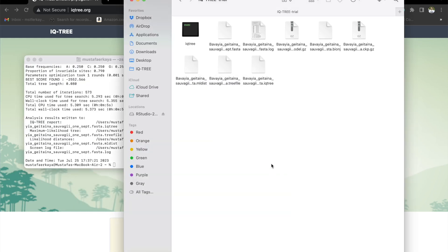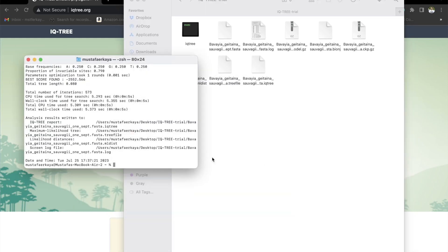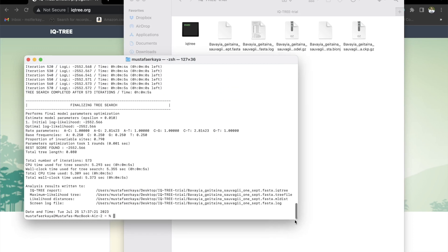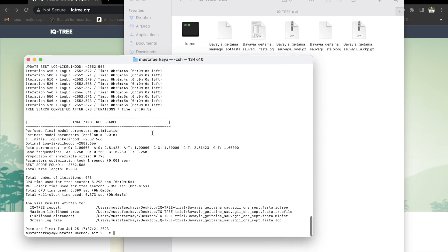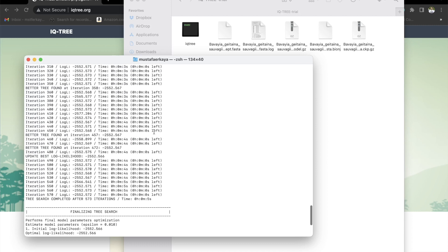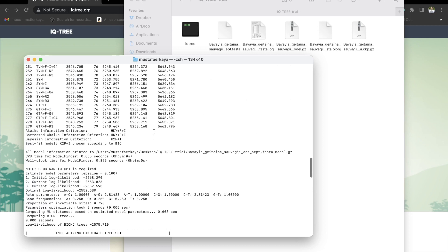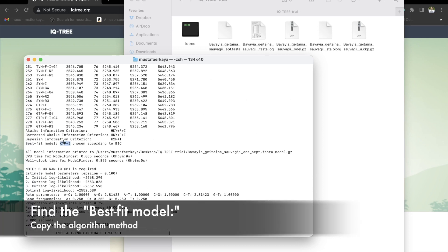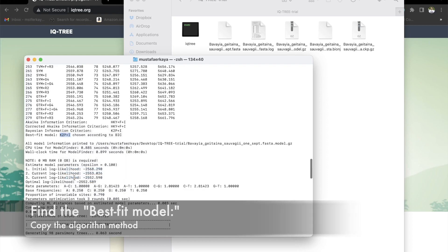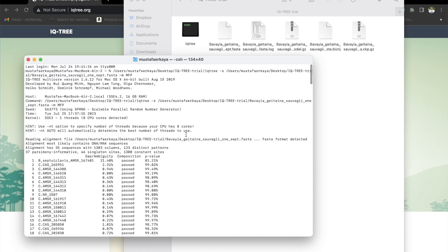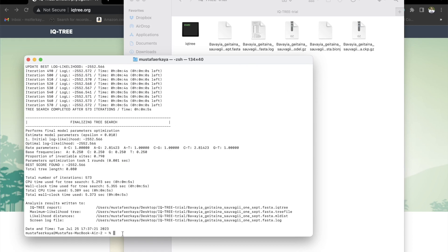As you can see in the background, now we have a bunch of files. But the most important part is going to be in the terminal screen. Let's scroll up a little bit. We are looking for this best-fit model. Let's copy this. The first analysis we did was to figure out what would be the best algorithm to create a phylogenetic tree for this specific FASTA file.